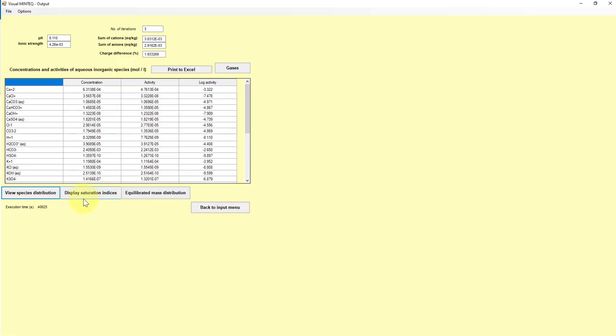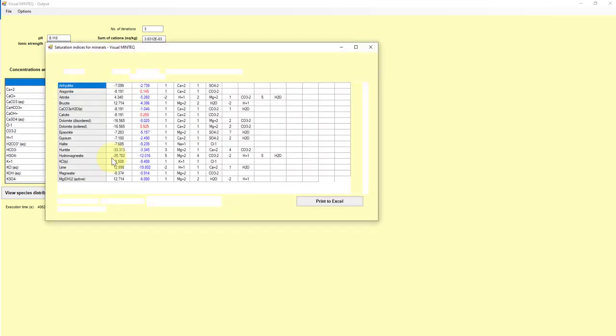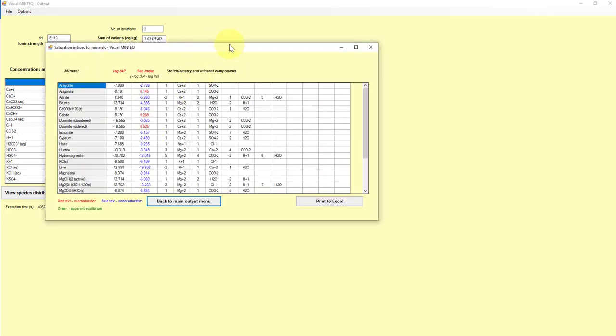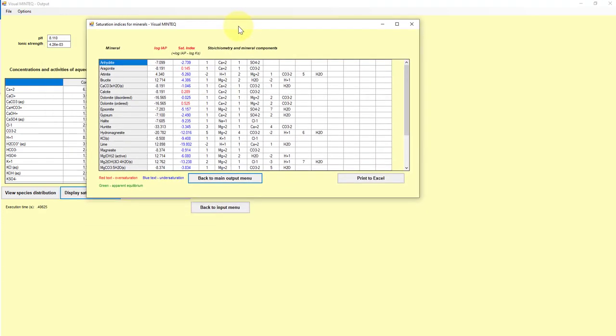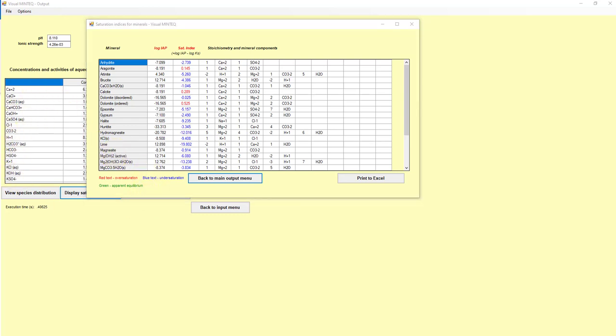This other button, display saturation indices, is really great for looking at natural waters, especially from a geochemical lens or environmental chemistry lens. So what this tells us is all of the possible minerals that may be formed with the combination of components or elements that were provided in that original data.